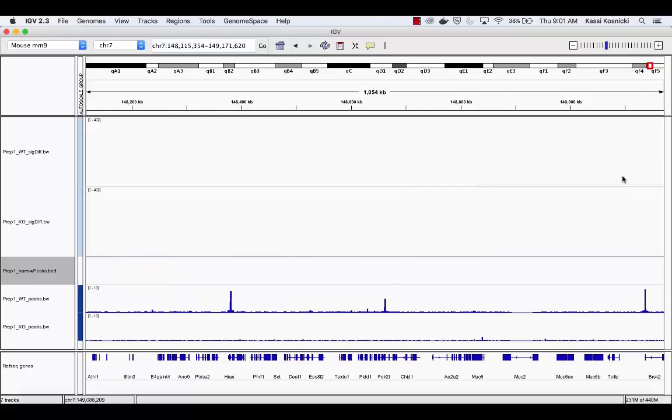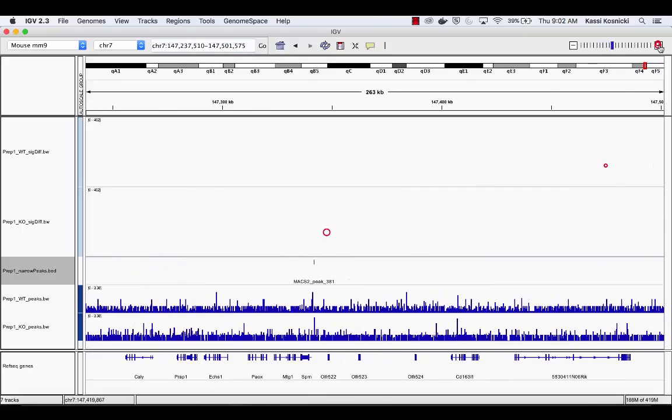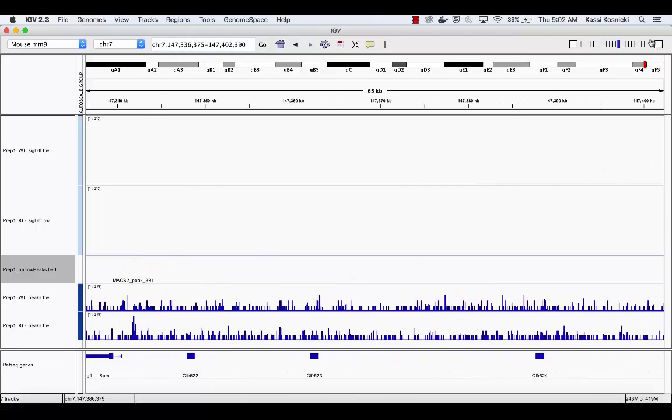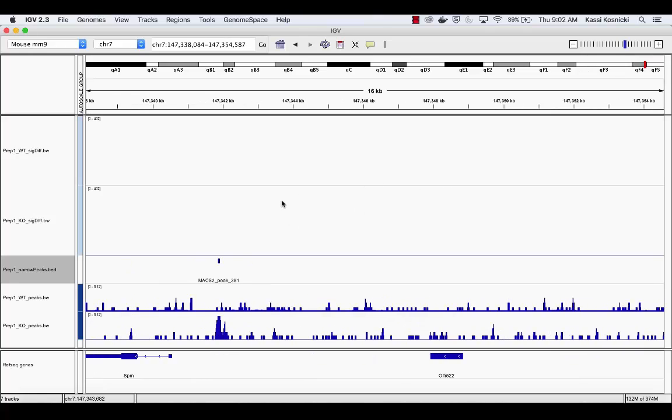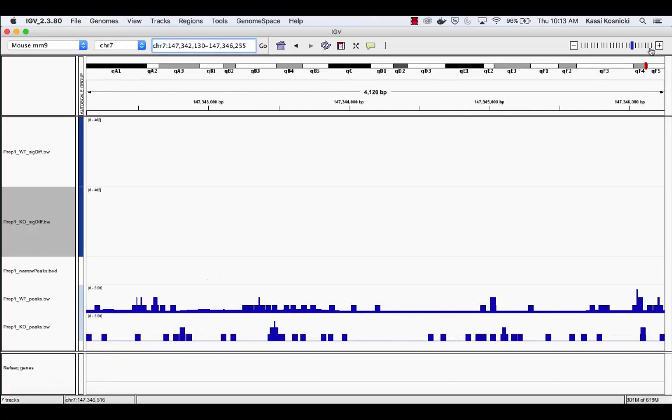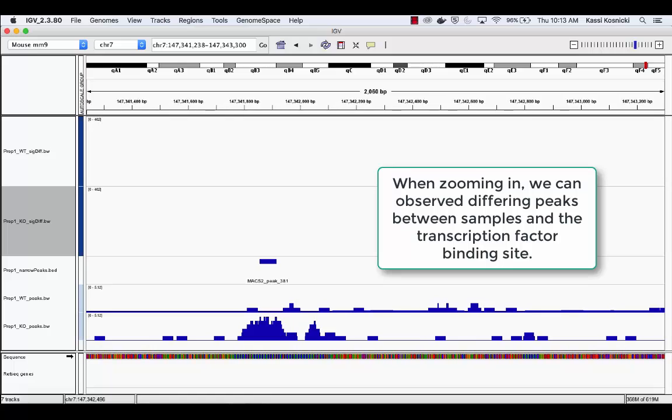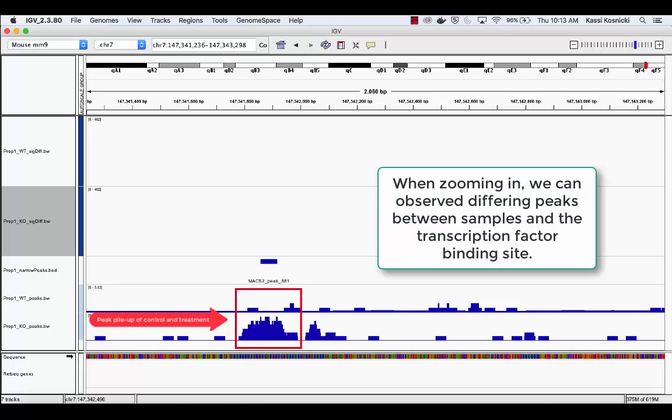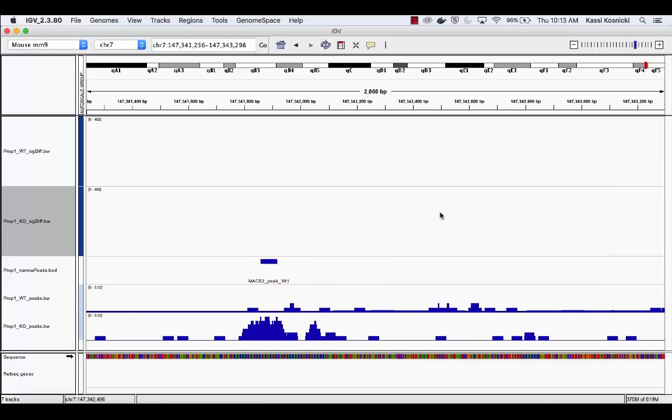To observe the peaks within both samples, the wild-type and the knockout, and the transcription factor binding site, continue to scroll left and zoom in. At this magnification, we can observe the differing peak pileup between samples and the peak of the transcription factor binding site. Be sure to record this locus region for later use.